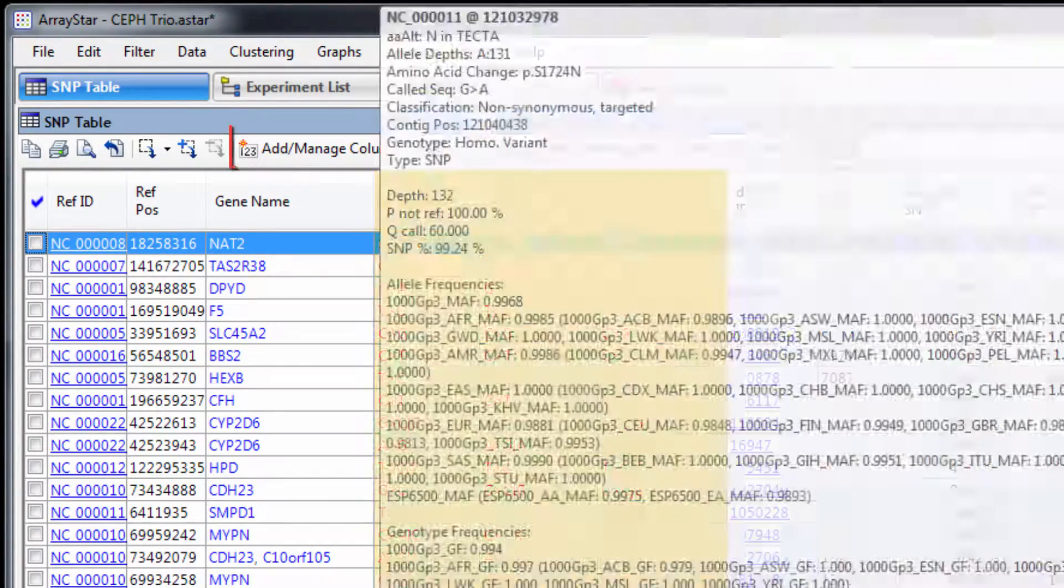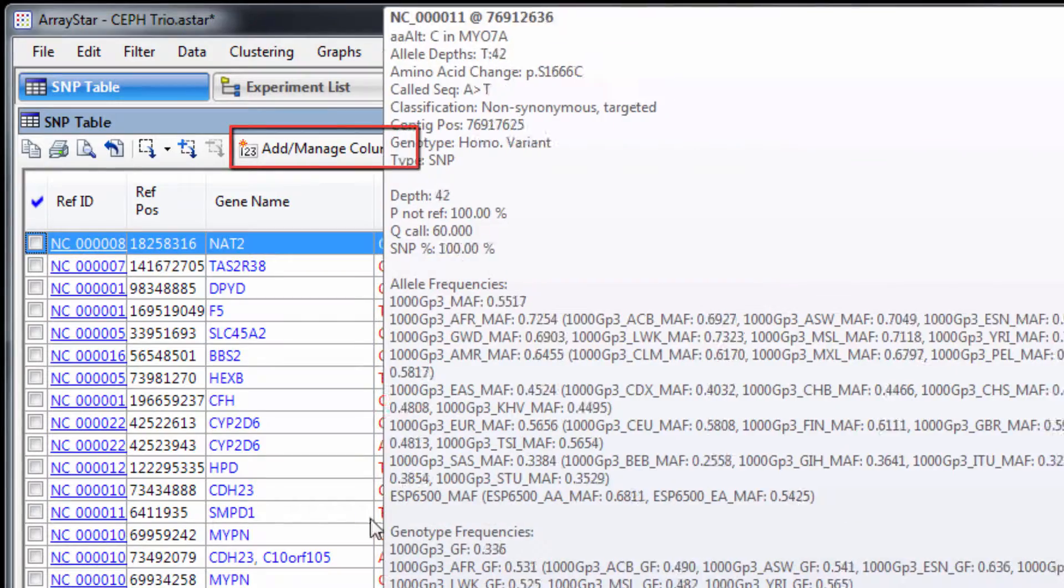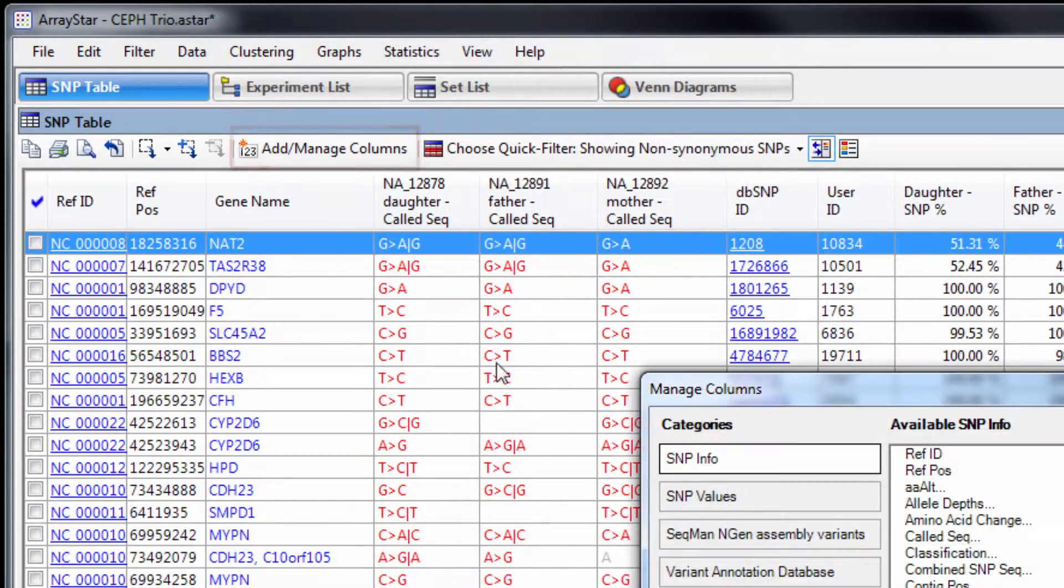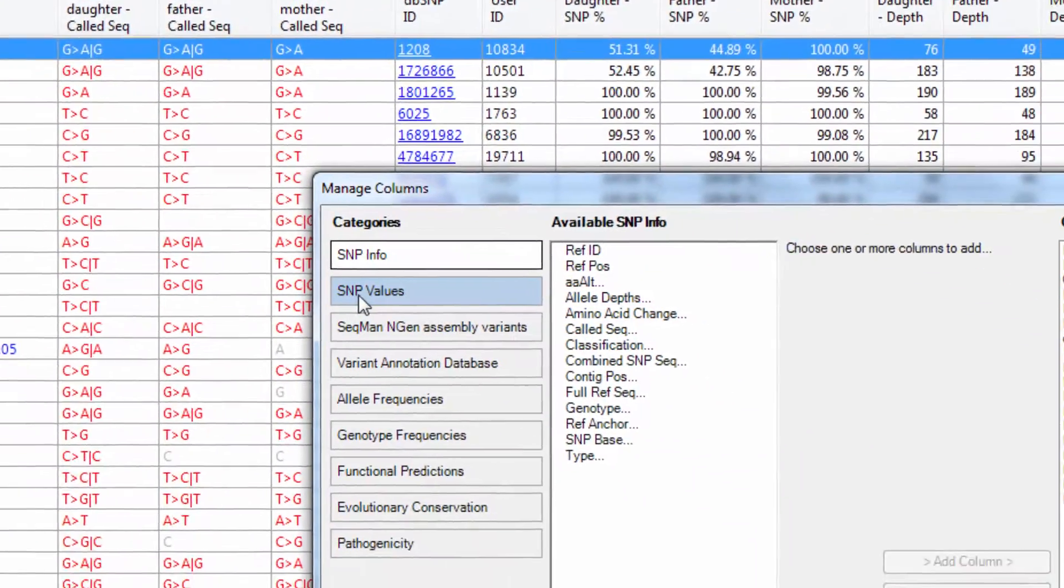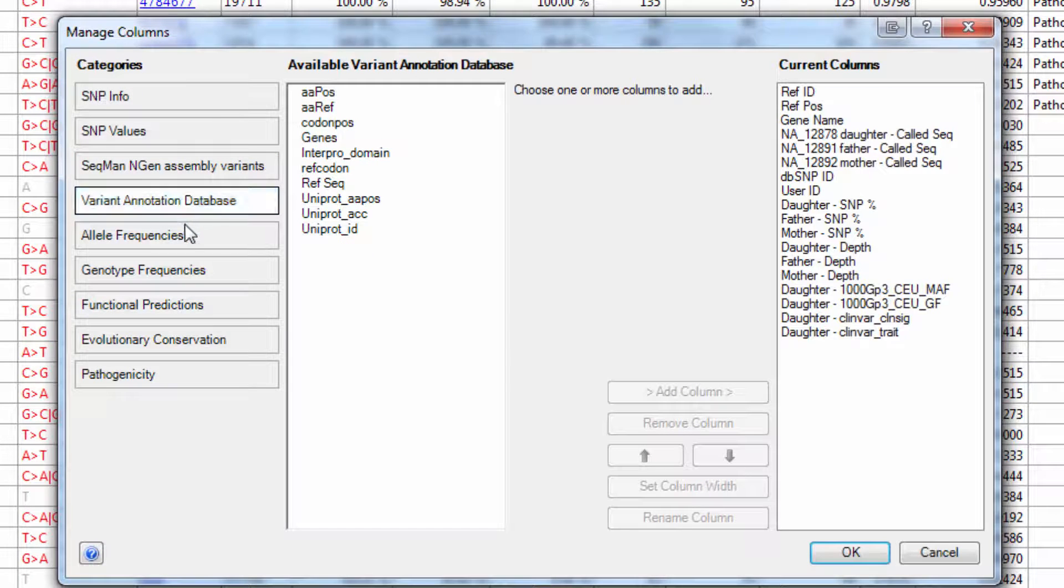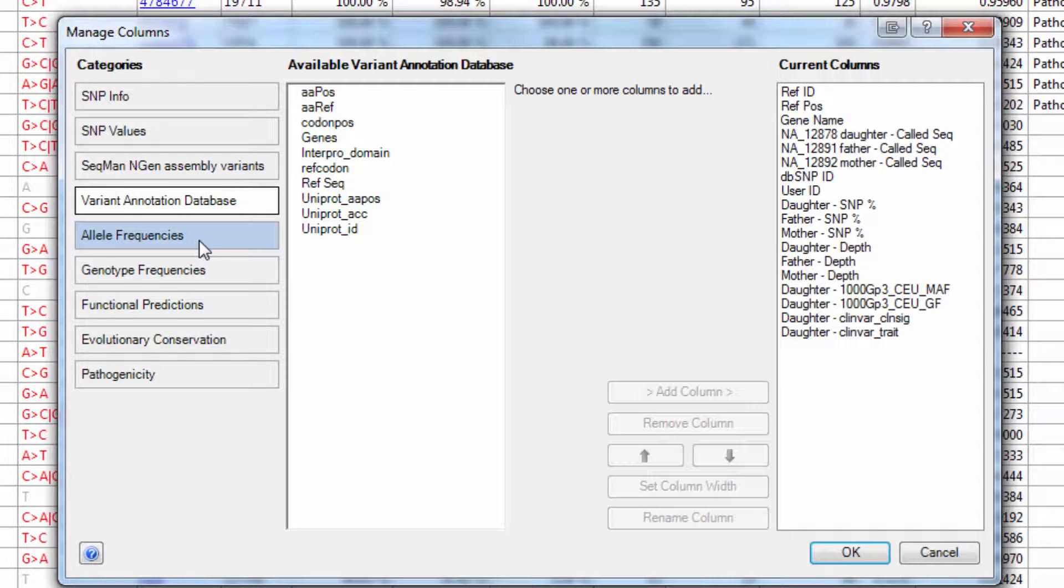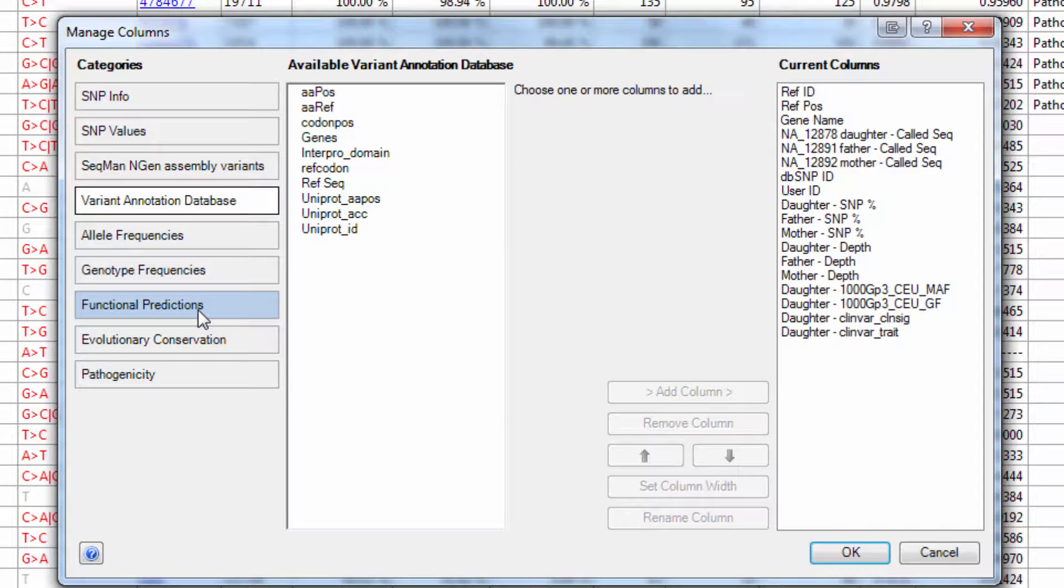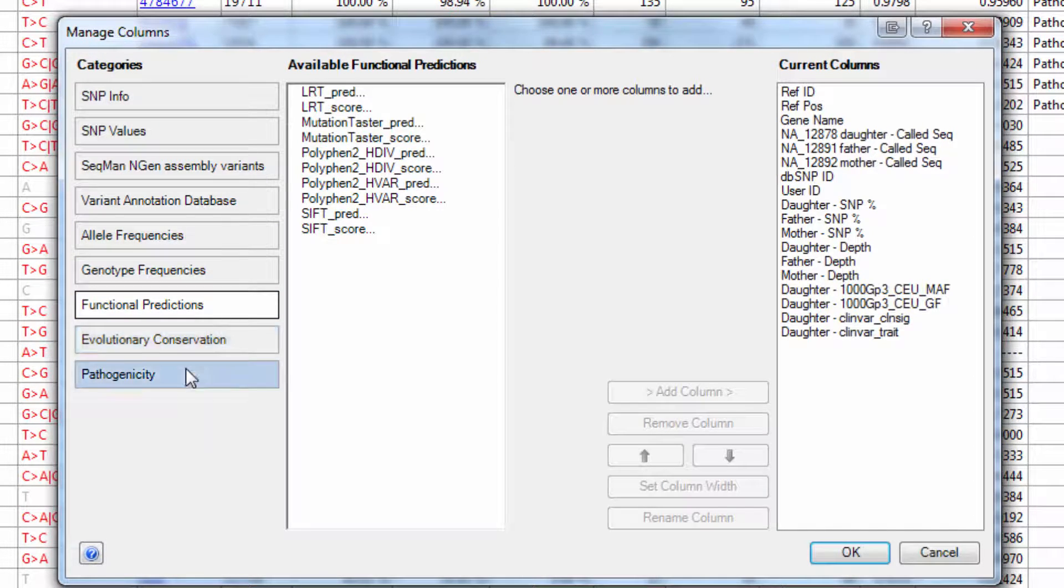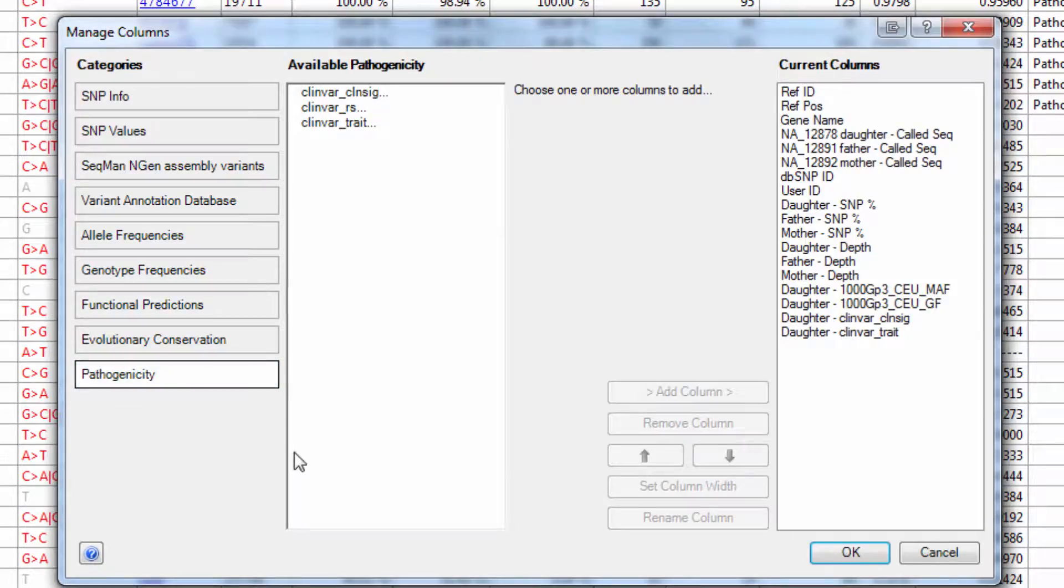Note that you can also customize the columns displayed in this table to show a variety of SNP statistics and annotations from the variant annotation database, including information on allele and genotype frequencies, functional predictions, conservation information, and pathogenicity.